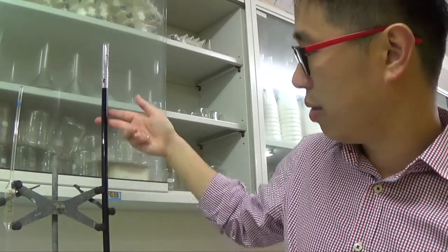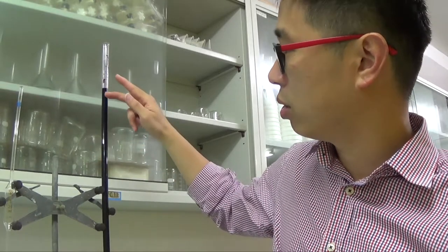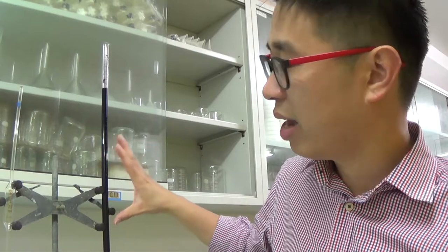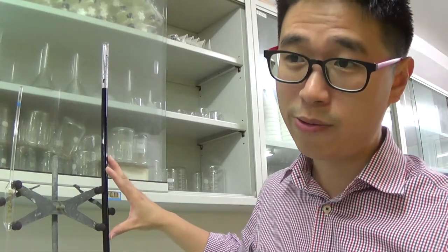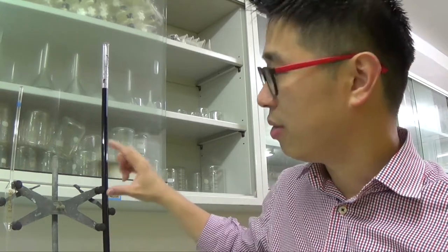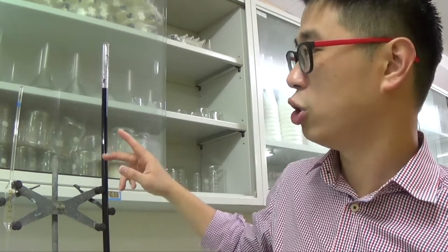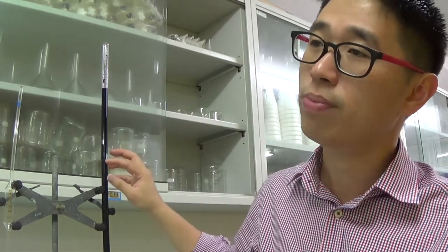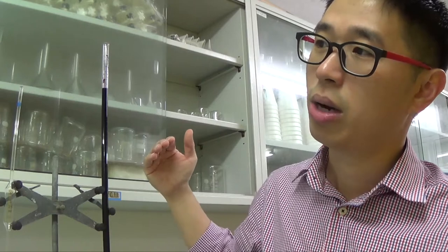However, if you have a little bit of water in the burette just now, that water will affect the concentration of the thing in the burette. And if you make the thing in the burette less concentrated with a little bit of distilled water left around, then what happens is, if this is less concentrated, you will need just a bit more in order to reach the end point because it's less concentrated. So you need just a bit more of the volume, and therefore your end point will be higher than what it should be.